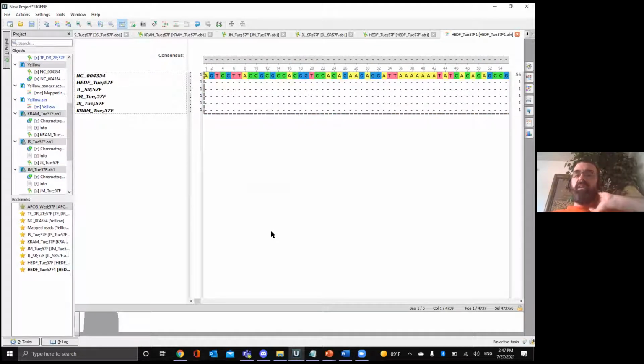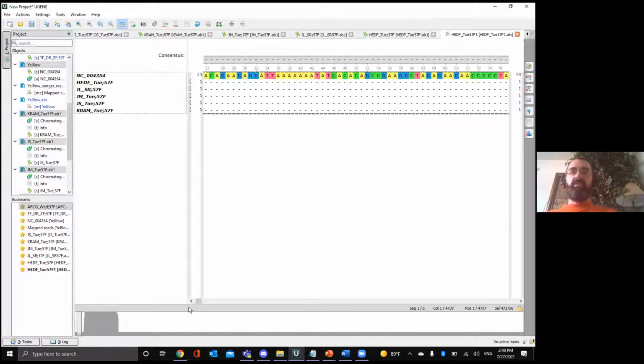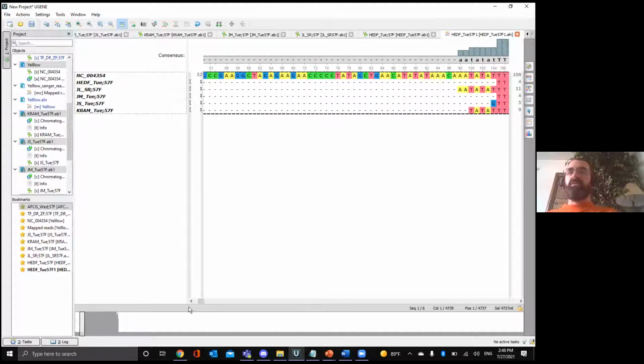Okay, so yeah, this looks a lot better. Okay, don't change anything there. Don't touch it. Okay. Leave it alone. You want to do this? You can do it. I don't want to touch it. Okay, so grab that gray box down at the bottom, or you can even use the slider. Either that one, or you see at the bottom that dark gray line with a bigger, thicker bit. You can also grab that too.